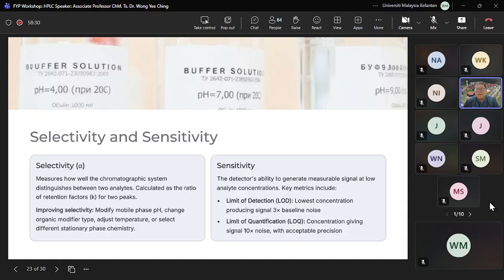This plays a major role with your background noise. If your background noise can be flattened out using the software, basically by doing some settings on the software, when you get very good noise leveling, you get a very strong signal even though the concentration of your analyte is very low.